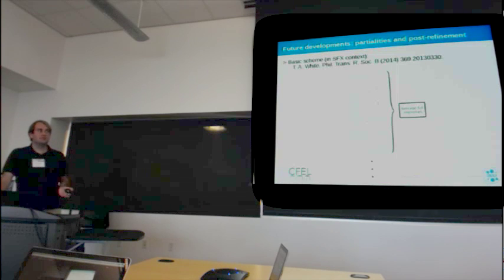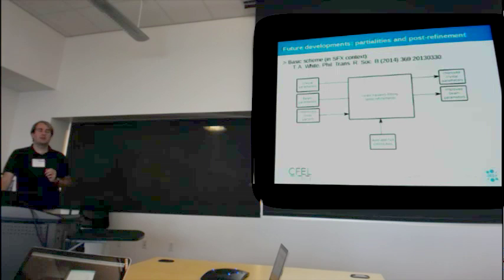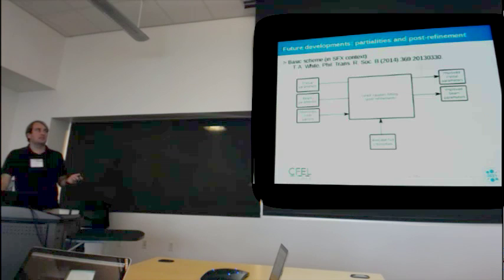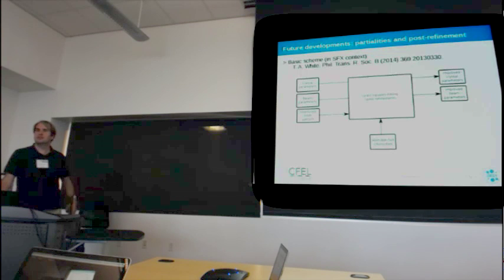We now do this for many diffraction patterns. We get many measurements of the same reflection and add them together, giving us a hopefully good estimate of the average intensity of that reflection. Then we do a refinement step. That's where we go back to every pattern in turn and refine crystal parameters and beam parameters using the intensities from the patterns, comparing them to the average full measurements. So the least squares fitting gives us improved crystal parameters and improved beam parameters. If we get better parameters, hopefully we get better data, and we iterate around this whole thing a number of times.